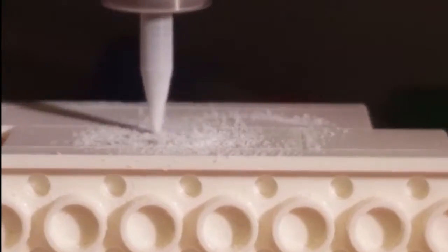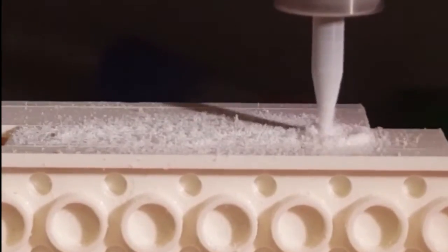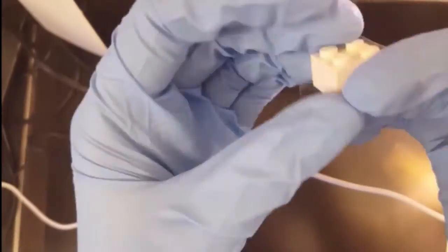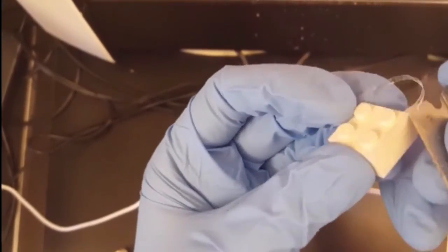For now, a Lego-based microfluidic device could be used to manipulate biological fluids and perform tasks such as sorting cells, filtering fluids and encapsulating molecules in individual droplets.